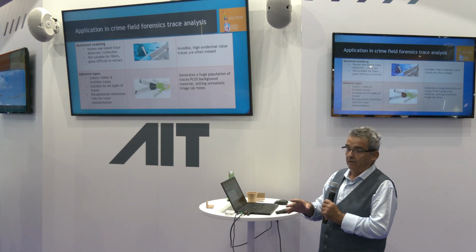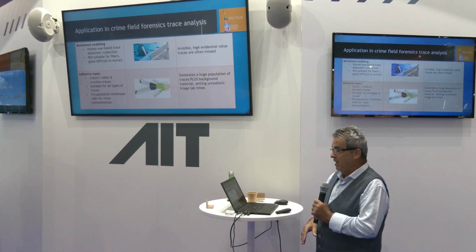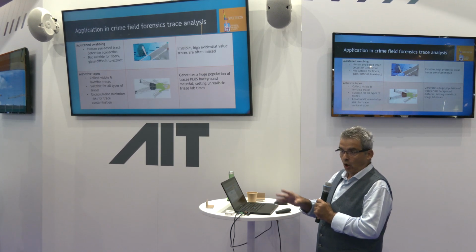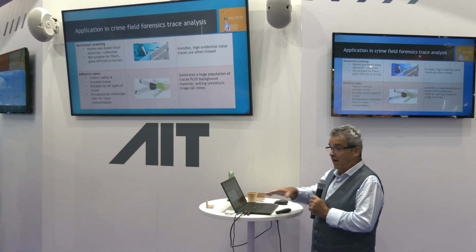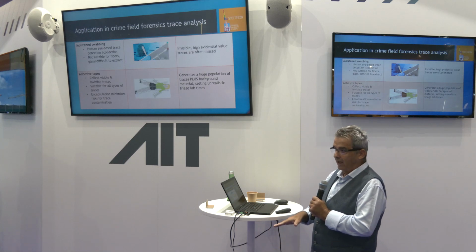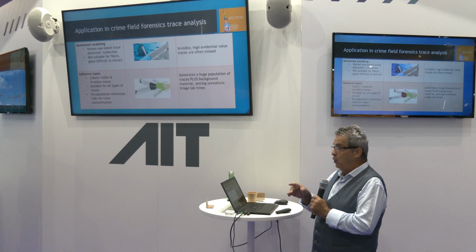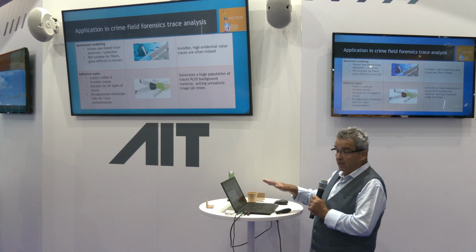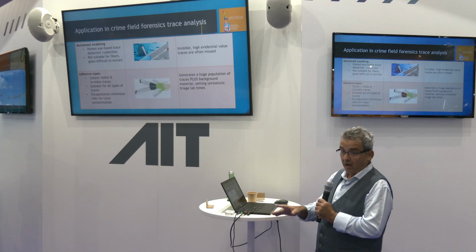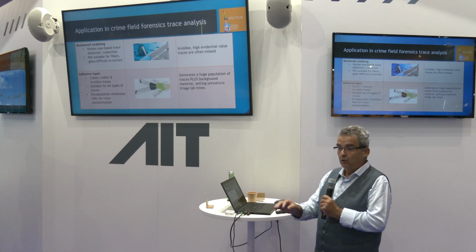I'm going to end my presentation with 2 examples, one from forensics and one from histology. So this is from forensics. They are using tapes to collect the traces in the crime fields. And if you ask the forensics department to analyze and identify all these tapes, it will take like 2,000 years for them to analyze frame by frame. It's impossible. And that's why they do sampling.